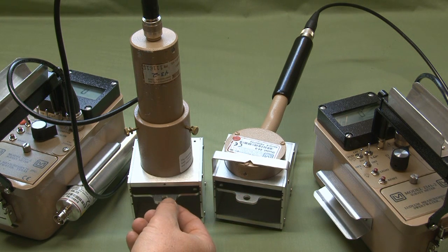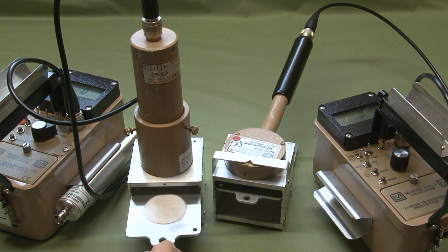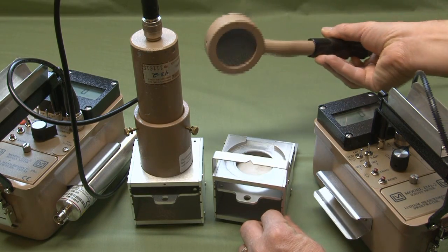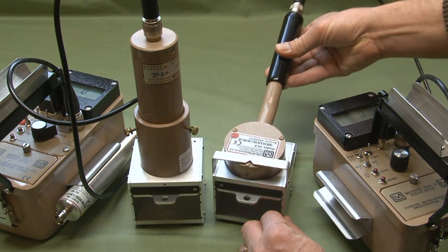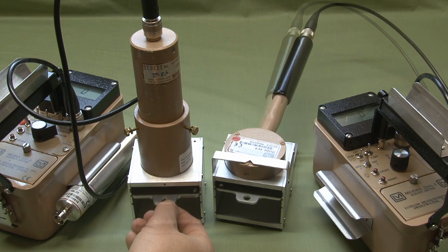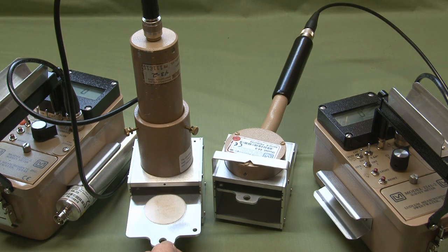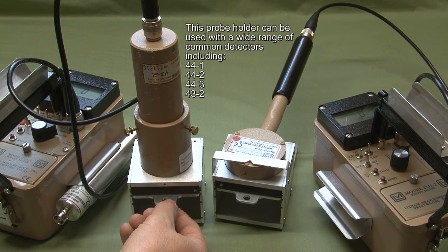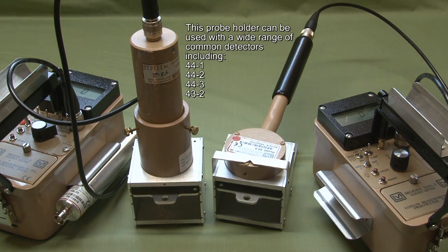Here are a couple of examples of sample holders. This one is designed to hold the Ludlum Model 44-9 probe, holding it in place for repeatable geometry with your smear placed on the little shelf. They also make one for the Model 44-3, which has an open window and allows for detection of alpha-contaminated items.